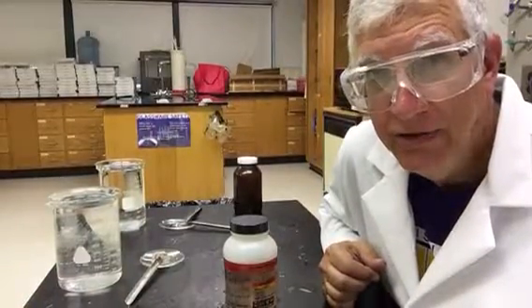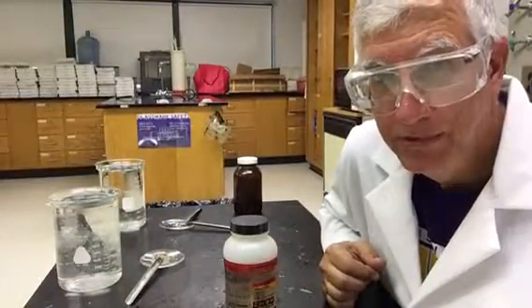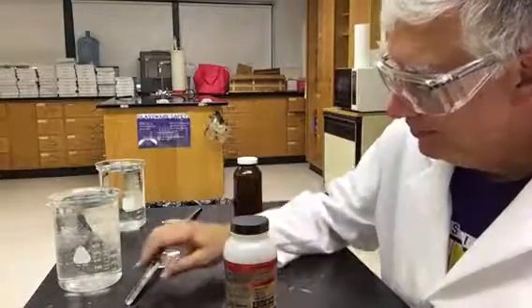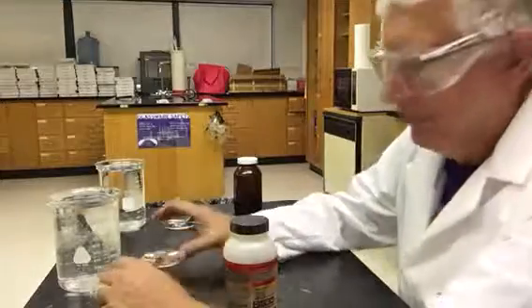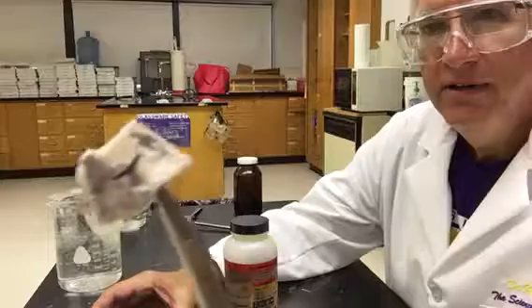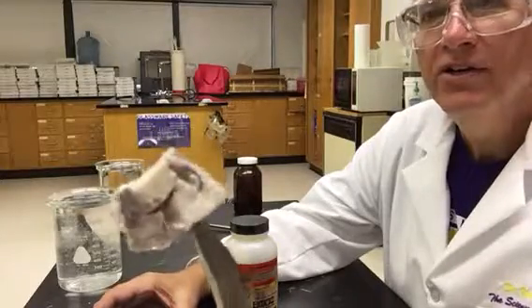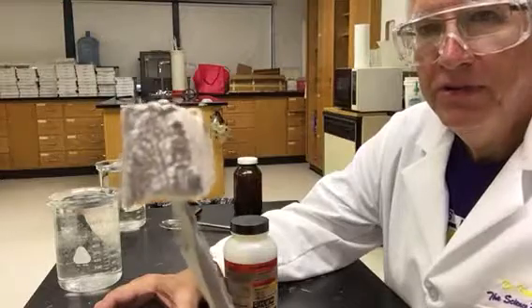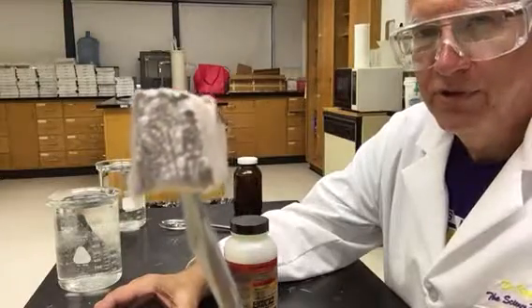Want to take a look at two of the alkali metals, two elements in group 1. First, we're going to look at sodium. Now, sodium is a metal. At first appearance, it's kind of a grayish, whitish color. But if you cut it open and you get a fresh piece, you can see it's more silvery.